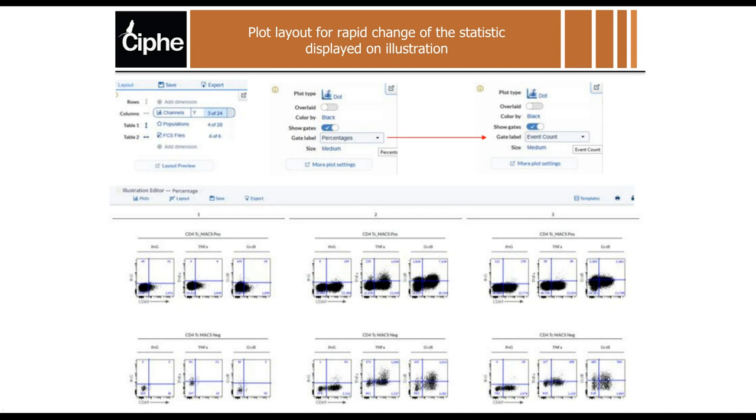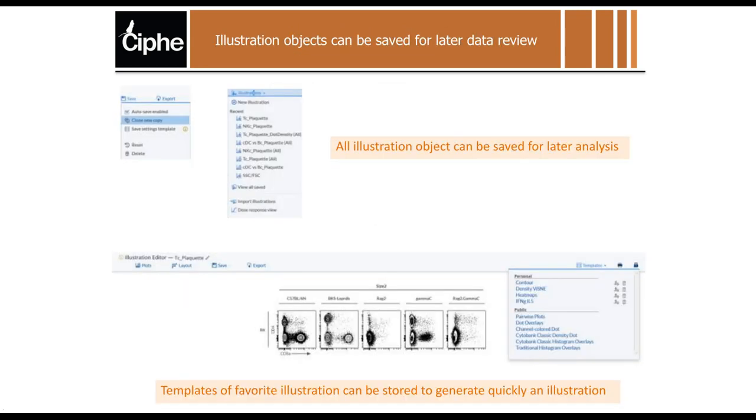So it saves you time on these finicky details and allows you to move forward into your hypothesis building that this teleconference needs to be. It needs to be a time where we share information and where we actually can make propositions to move the project forwards. And that's what I really liked about the use of Cytobank in this way over collaborative TC we may have at CIPHE.